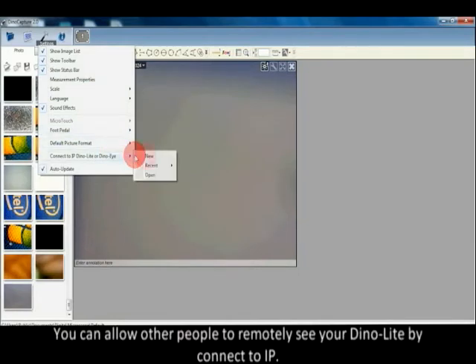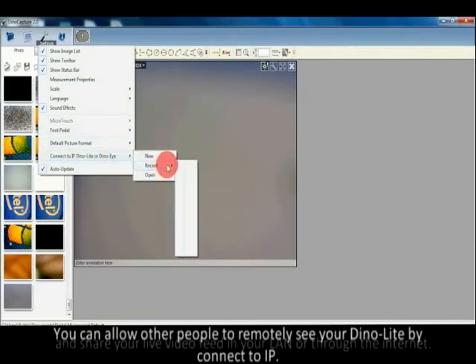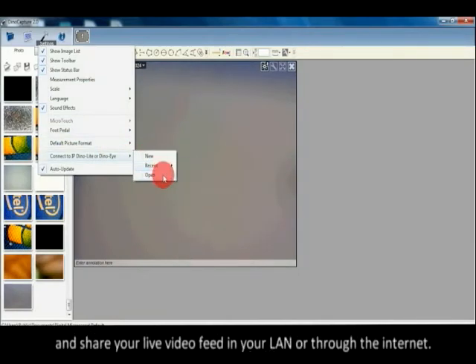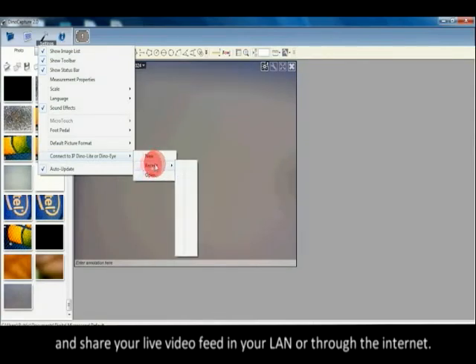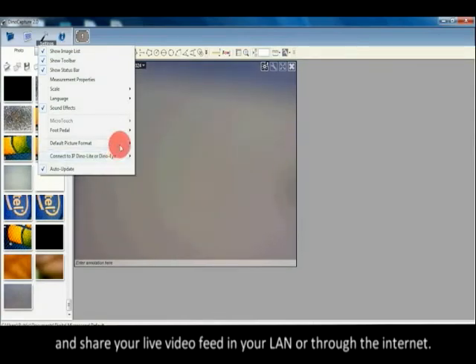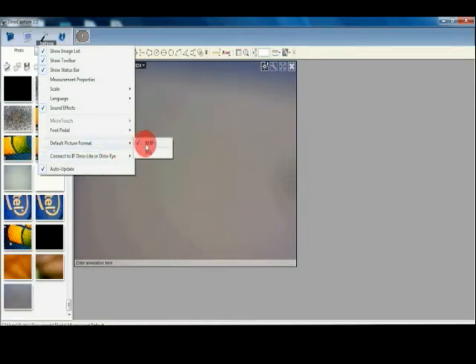You can allow other people to remotely see your DinoLite by connecting to IP and sharing your live video feed in your LAN or through the internet.